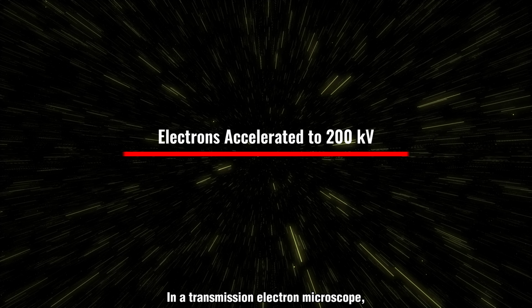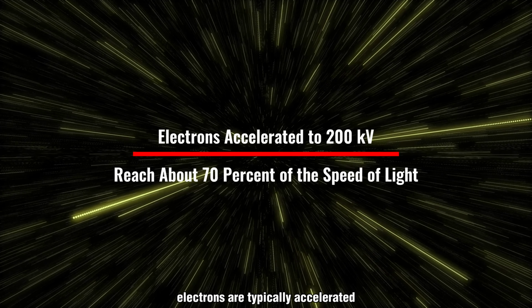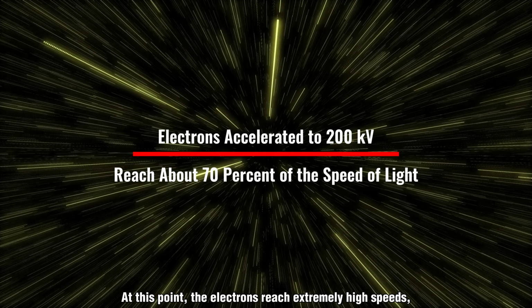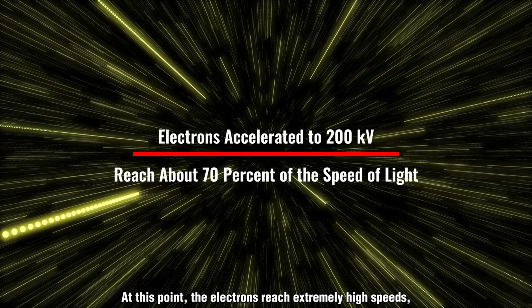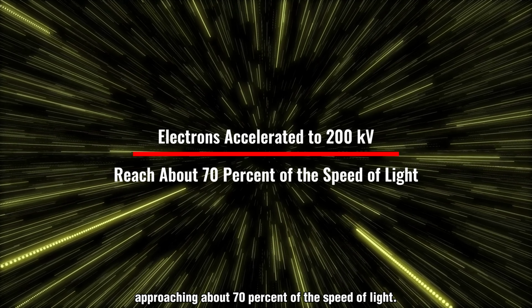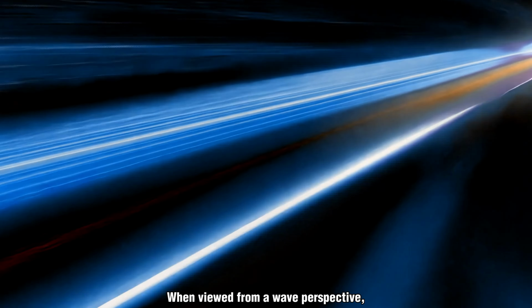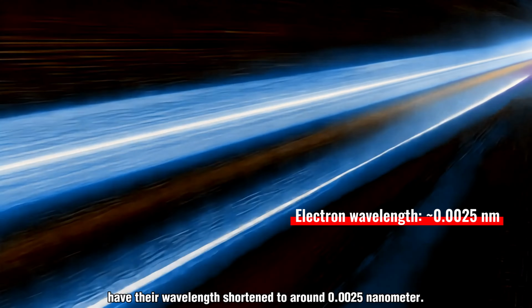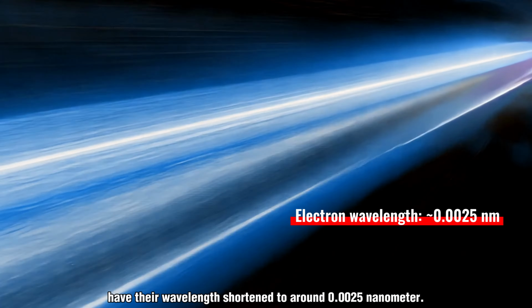In a transmission electron microscope, electrons are typically accelerated using a voltage of about 200 kilovolts. At this point, the electrons reach extremely high speeds, approaching about 70% of the speed of light. When viewed from a wave perspective, electrons accelerated in this way have their wavelength shortened to around 0.0025 nanometer.